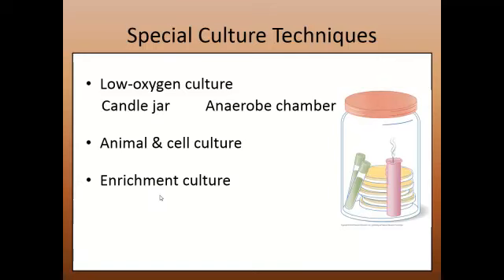So if we have an organism that eats petroleum, we would enrich the culture media with petroleum to promote the growth of that organism. Whereas in the process, we would get rid of those organisms that don't particularly like to live in a whole bunch of petroleum. But petroleum in and of itself is not toxic like dyes. So it's not selective, but it is promoting the growth of the organism that we want.